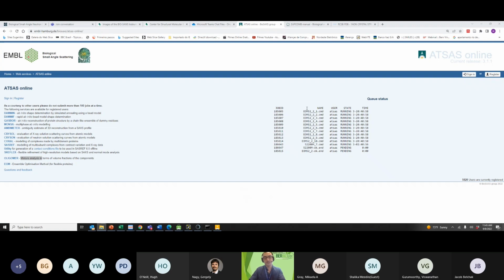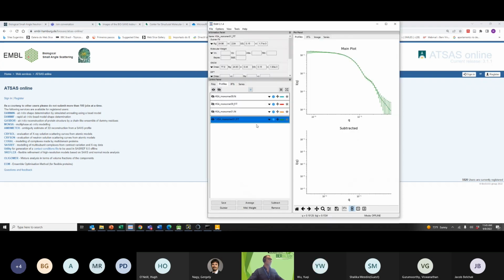I think in the other section, if you want, you can watch the Venk sessions as well. He probably touched on those types of fitting. I know Jacob and Yuki have SANS data to analyze that was collected on BioSANS.